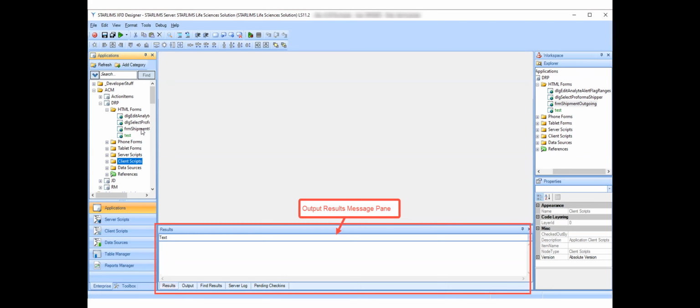And sometimes it's not easy to spot that. You've got hundreds and hundreds of lines of code, and you may have copied something from another location into your code when it was working fine over there, but when you copy pasted it, you missed that last little semicolon, and now it's crashing and you don't know why. Well, that's where you're going to find it in this server log.